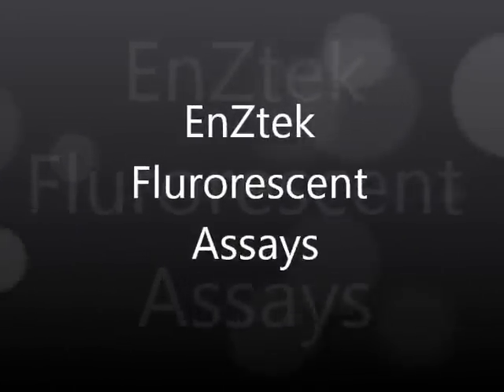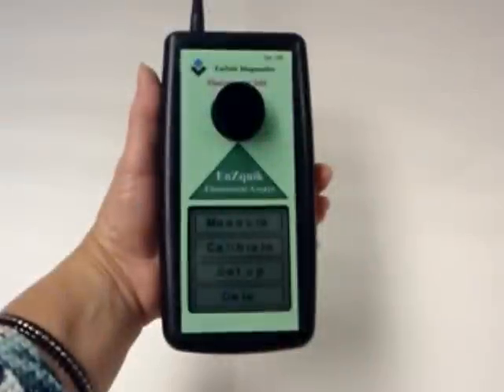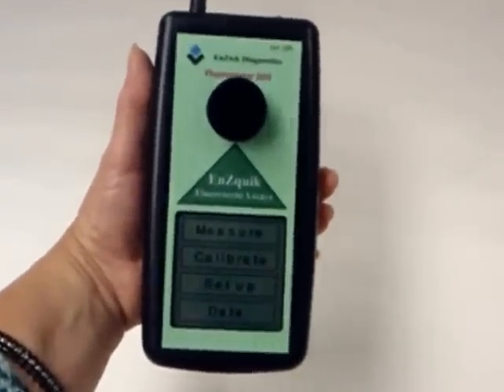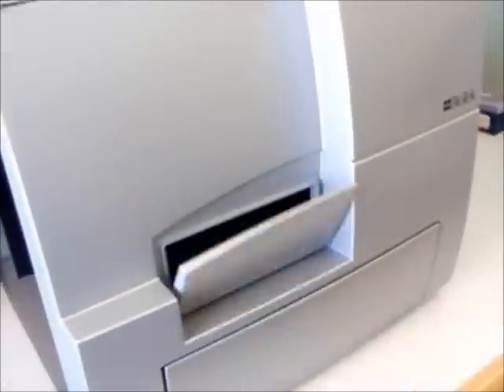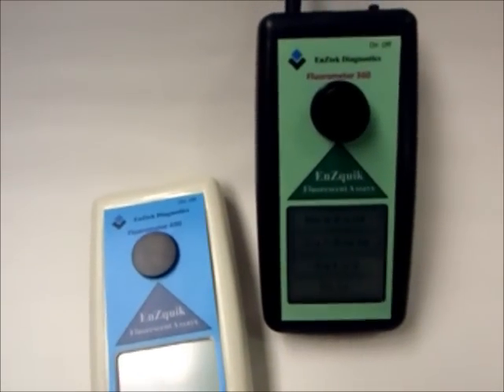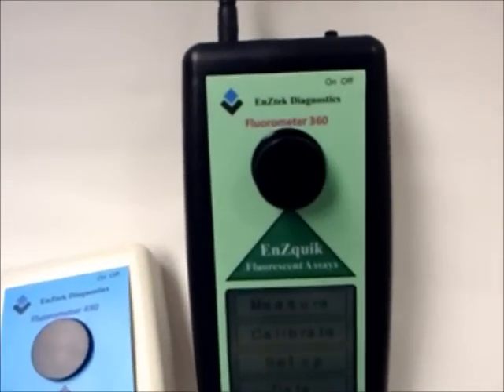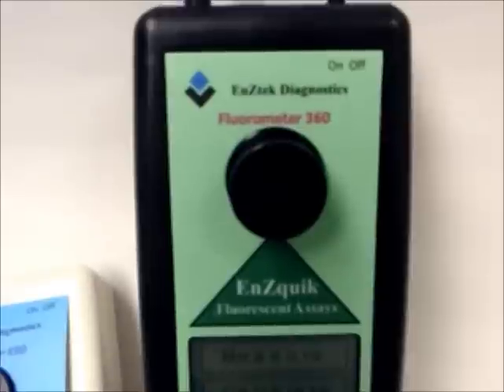The Enzatec Fluorescent Assays can be performed on handheld fluorometers or tabletop fluorometers. It is important for the fluorometer to have the correct wavelength emission and excitation which is specific to each assay.